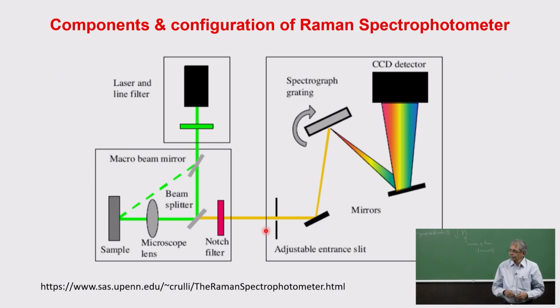It's much different in terms of the instrumentation, which came at least 30-40 years later. Of course the effect was shown by Raman in his 1928 paper or earlier, but he did not use a laser, because the laser was not developed at that time; it was shown with a conventional lamp, and these things were developed much later.